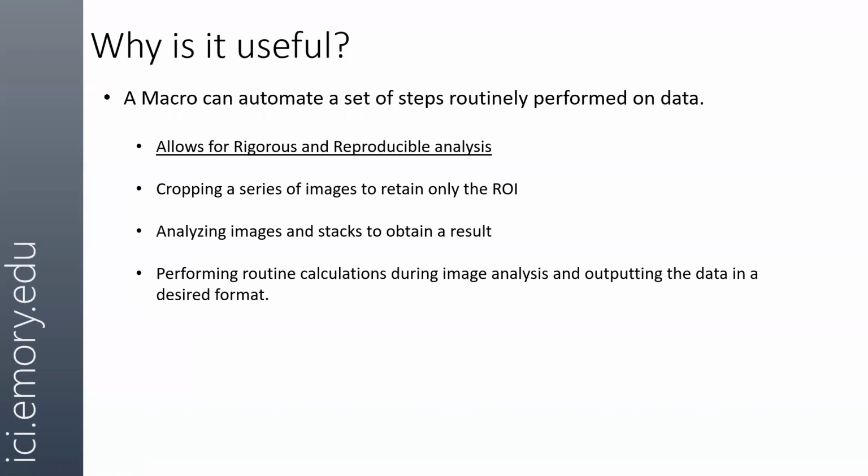Now, some of you might be asking, why would we want a macro when I can do it by hand? Well, one of the reasons I already mentioned, macros, since they're specified programmatically, they always follow the same set of instructions and they always follow them the same way.